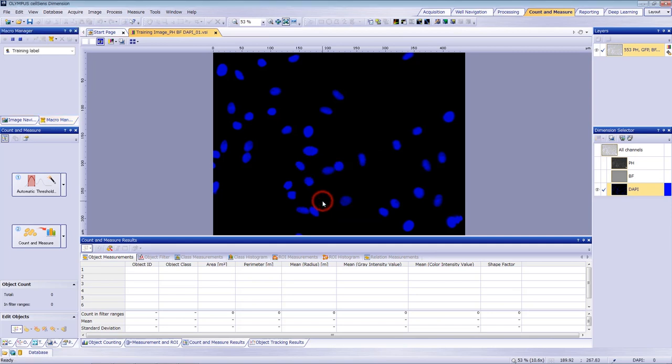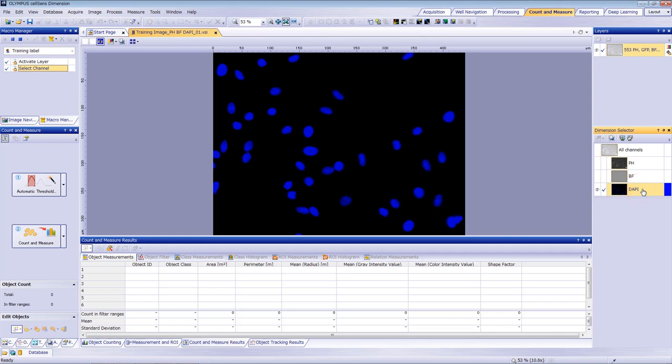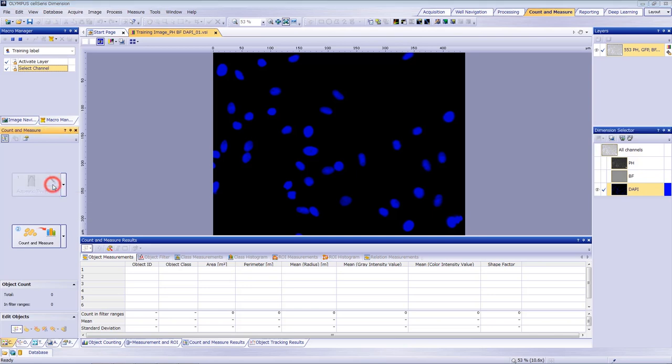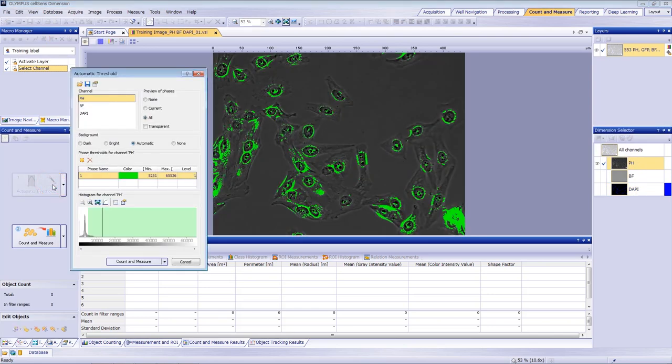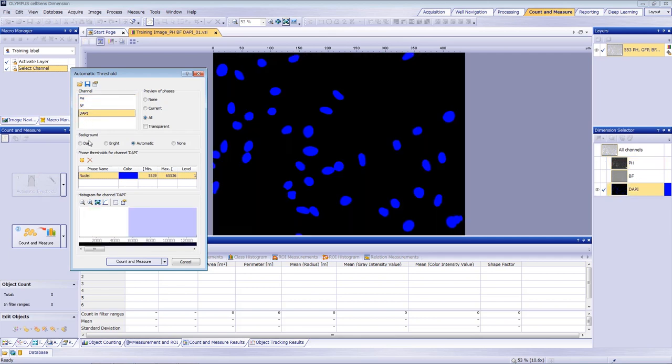Then select the DAPI channel from Dimension Selector. Select Automatic Threshold to automatically apply an intensity threshold on the DAPI channel to detect nuclei. Then click DAPI channel. Double-click on the phase name to modify it.